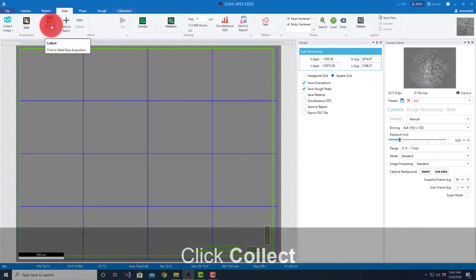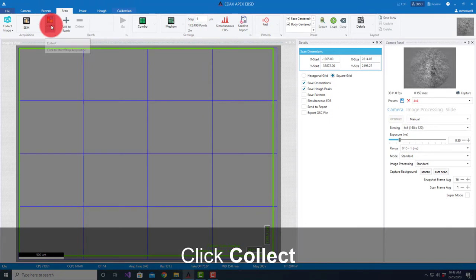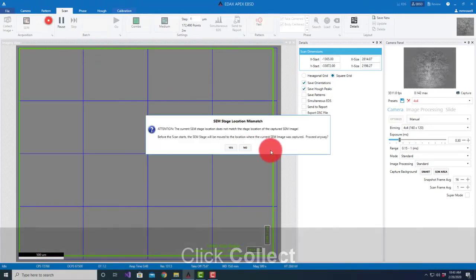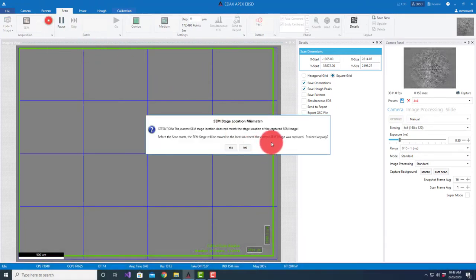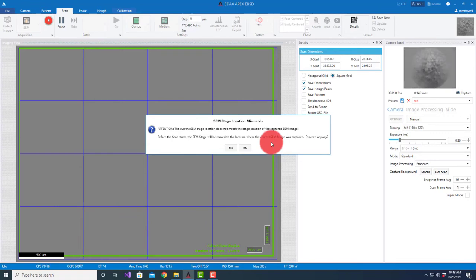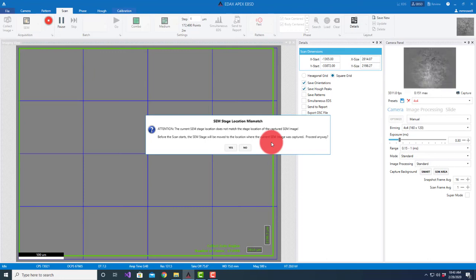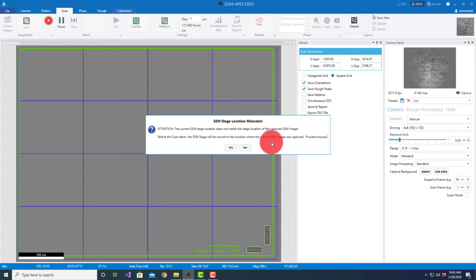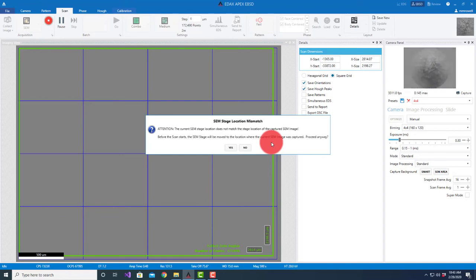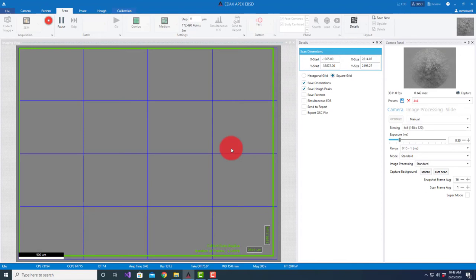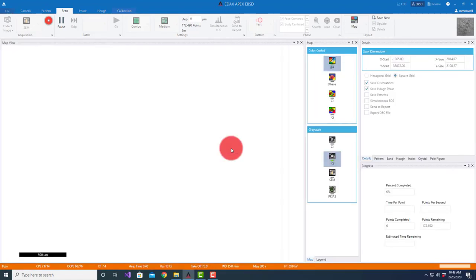I'm going to go ahead and say collect. It gives us a little warning because it says the stage is going to move. Whenever we're going to move the stage we want people to know that it's going to move. Generally we like to make sure across the full range of motion that there's room to position the sample. You always have to be careful when you're going to move a stage with an EBSD detector inserted because the detector is close to the sample and we're tilting the sample 70 degrees. I'm going to hit yes.